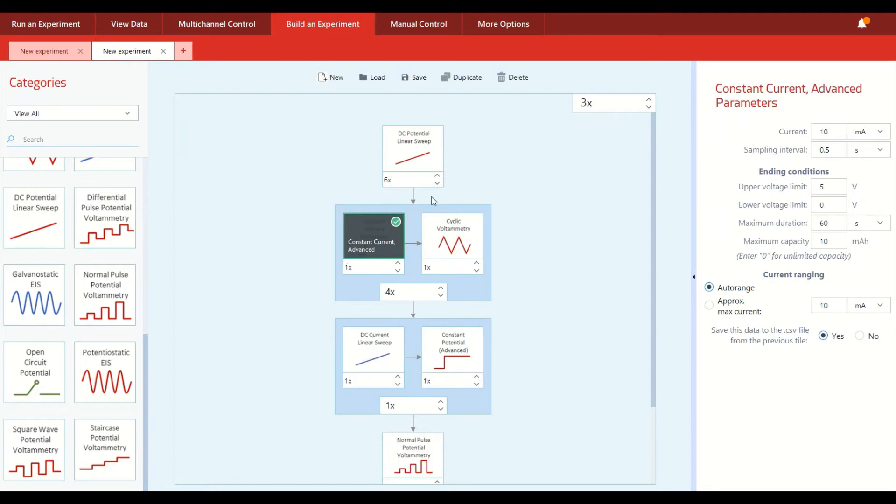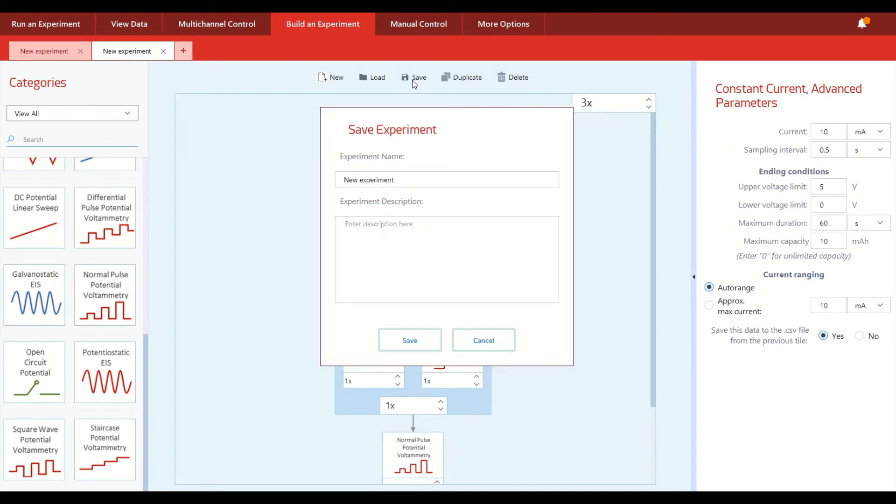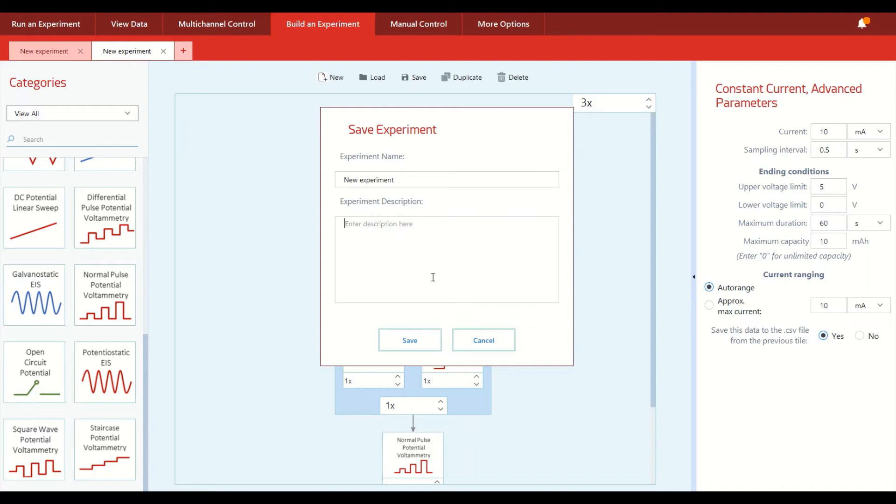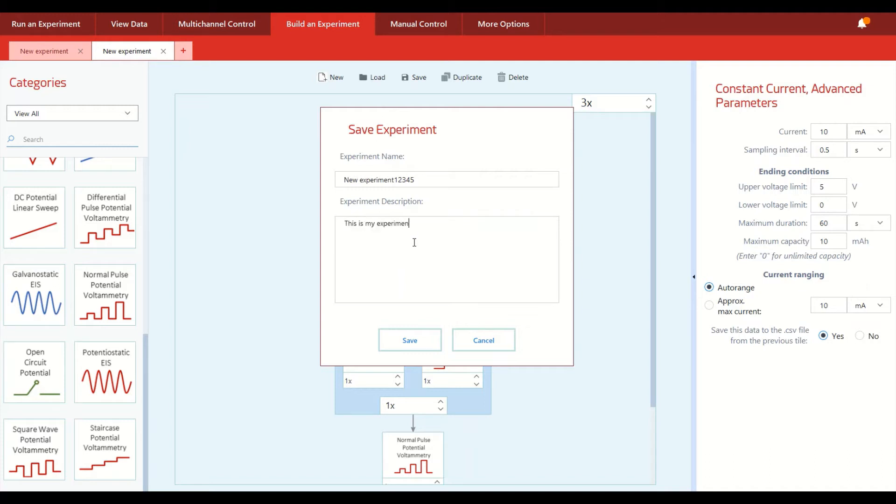Once you have finished creating your custom experiment of choice, it's simply a matter of saving the experiment with an accompanying description, especially if you are sharing this Potentiostat in a group lab environment. It's important to be able to clearly label what's going on with each one of these custom experiments that are created. So for example, we could just type in a name like so and say, this is my experiment description.